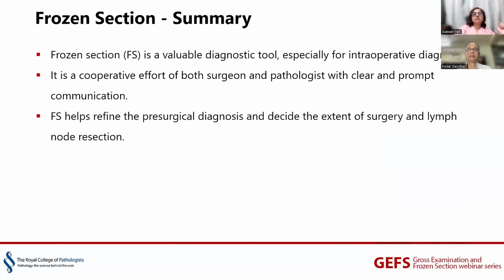So to summarize, frozen section is a valuable diagnostic tool, especially for intraoperative diagnosis. It is a cooperative effort of both the surgeon and the pathologist.